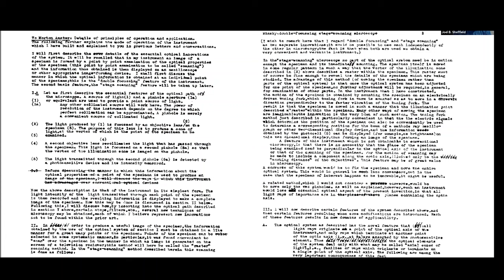This is, I don't expect you to read this, except this is the letter that he wrote to his lawyer about the description of the patent and how this operation works. What I will post on the notes is Minsky's actual memoir of this, which he wrote in 1988, 30 years later, when he was finally urged by one of the people involved in microscope development to really write this thing out. It's a wonderful discussion of how he set this thing up.